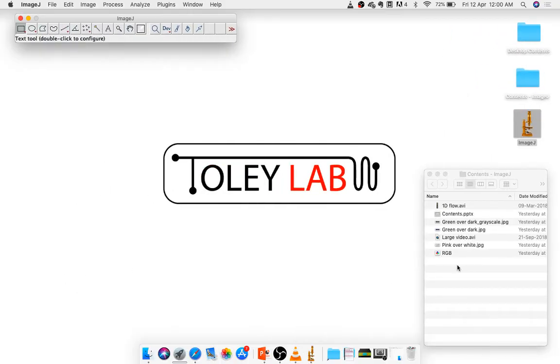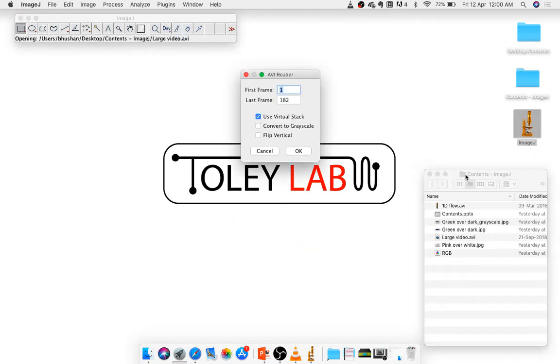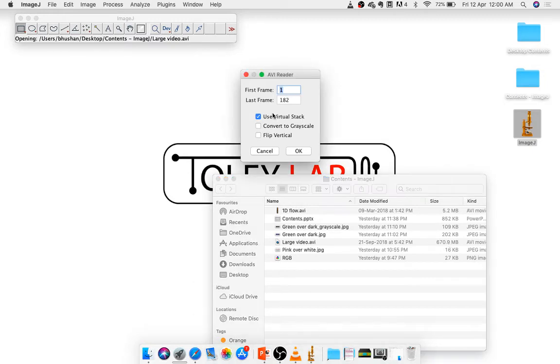So for that, I have chosen a large video. The size of this video is around 600 MB, if you see here. Around 670 megabytes. It has 182 frames. Now, when I open this, if I want to make any major changes, don't use virtual stack. If you don't use virtual stack, which is what I'm trying to do now, the entire 670 MB is actually opened, and you can do all of the required processing. If you use a virtual stack, sometimes the processing abilities are limited, but it saves on the RAM.